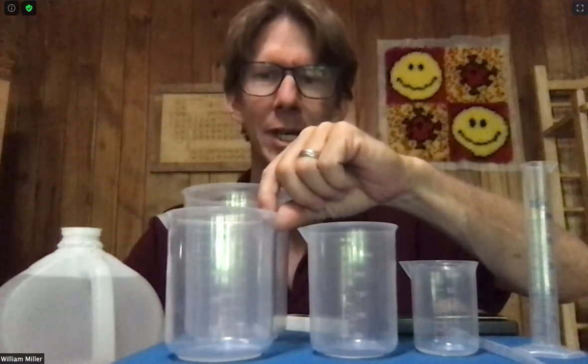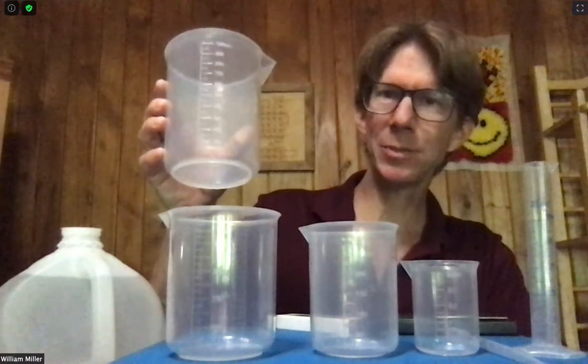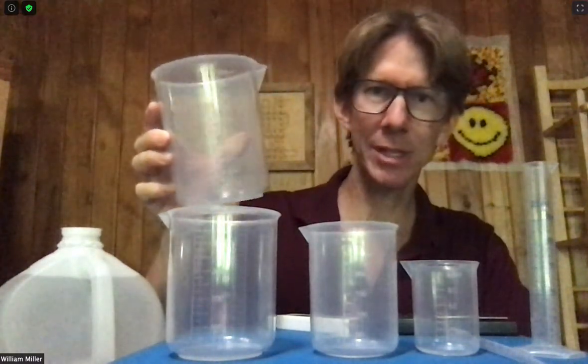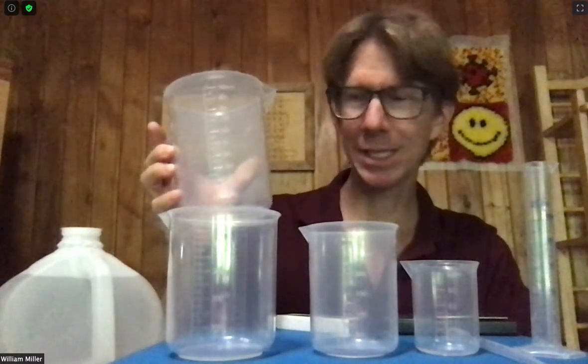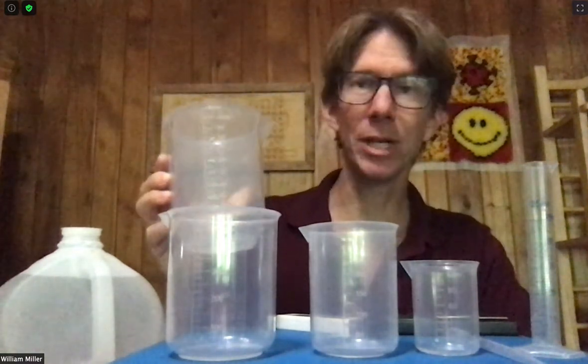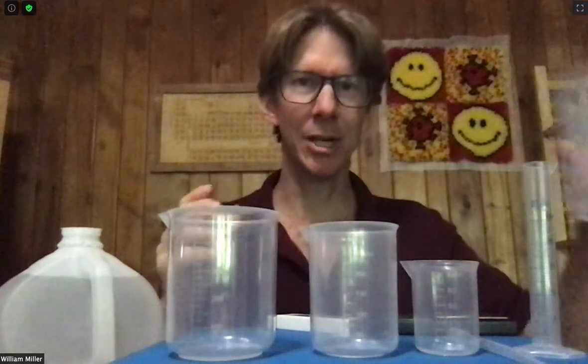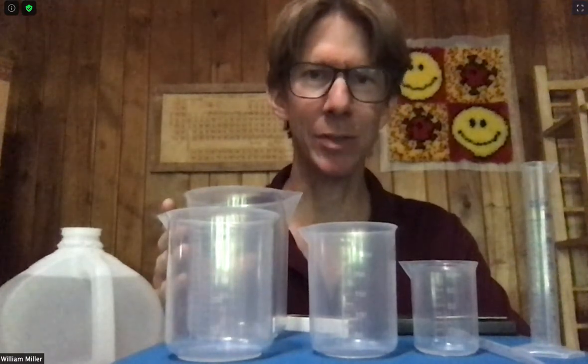Then I have a beaker that holds more than 400 milliliters — this one holds 500 milliliters. I also have a waste beaker, and I just tend to choose the biggest beaker I have that I don't otherwise need. This is just going to be holding distilled water, so not a whole lot of waste, but it is nice to have a place to dump your waste so you don't have to go over to the sink in the middle of your experiment.